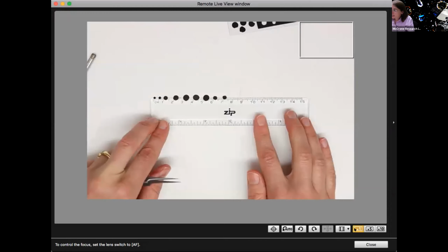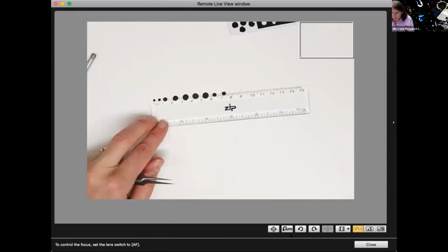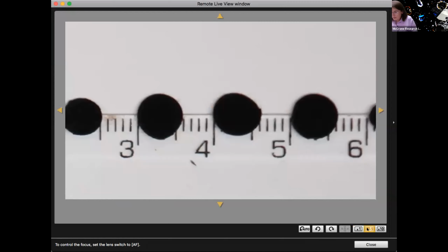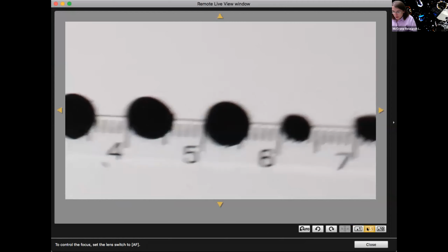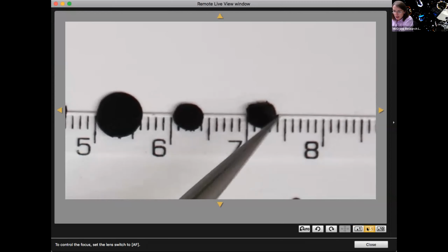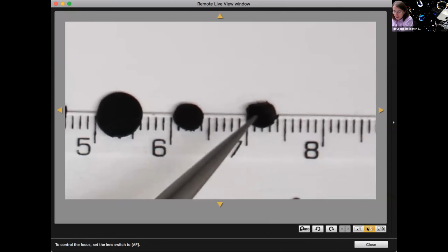But if we have a look here, in fact, let me zoom in so you guys are able to see a little bit better. Move that over. So there's the one I just cut. It's a little rough. So if I were making a dispersion staining objective, if I was making a new one, I probably wouldn't choose this spot. It's a little too rough looking, but some of these are better.